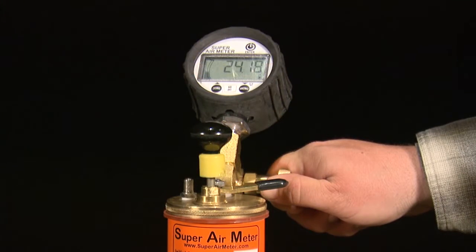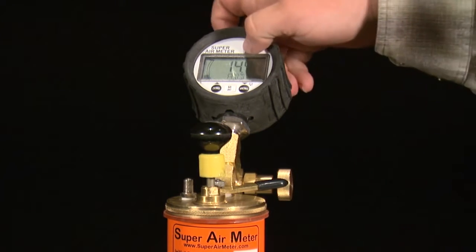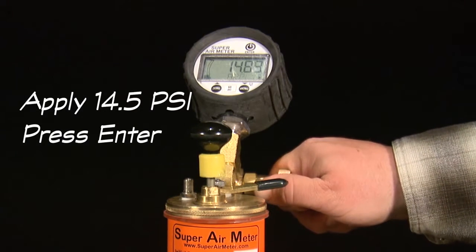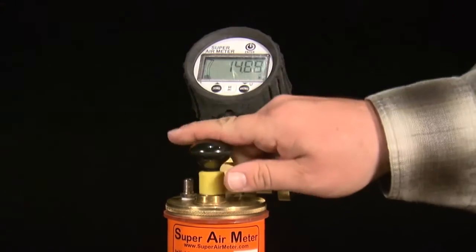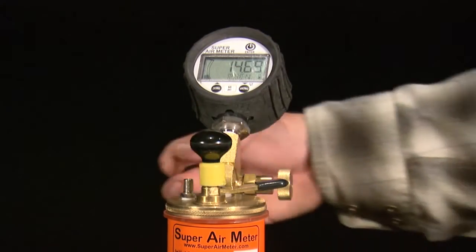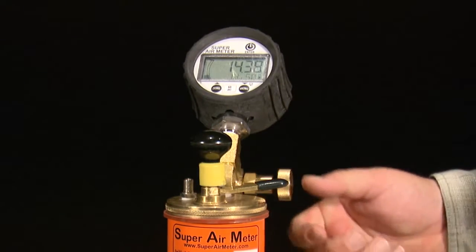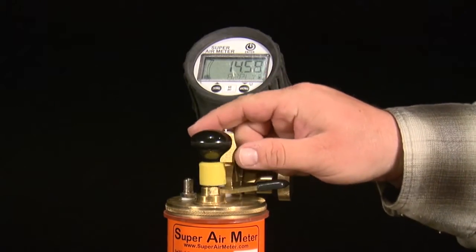At this point, be sure to relieve the pressure in the top chamber to below 14.5 PSI. Press the enter button and the next set of test directions will be displayed: apply 14.5 PSI and press enter. Use the pump or the cape to pressurize the top chamber to 14.5 PSI and press the enter button. The gauge will verify the value is correct and display either okay, too low, or too high.